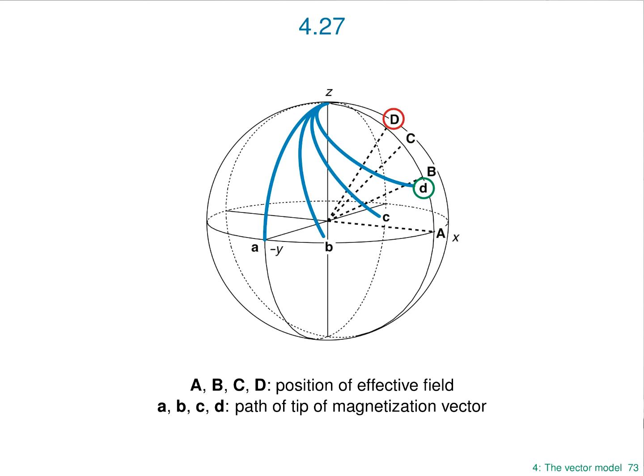So what does this tell us? It tells us two things. As you go off resonance, instead of the pulse just generating y magnetization, it generates a mixture of x and y. That's what those paths B, C, and D show you. And they also show you that as you go off resonance, you generate less and less total transverse magnetization. So A is the only one that actually made it all the way to the transverse plane. None of the others did.